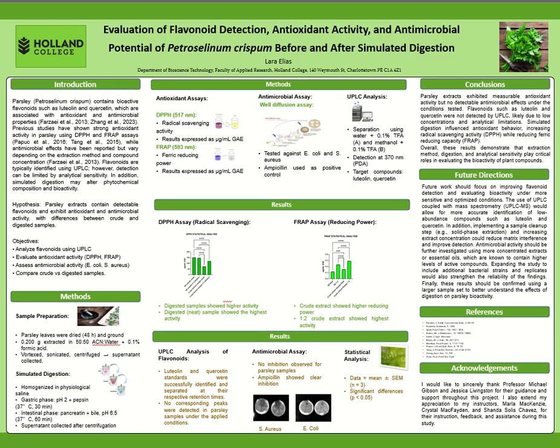Overall, these results highlight the importance of extraction, digestion, and analytical sensitivity when evaluating plant bioactivity. Future work should use more sensitive techniques such as UPLC-MS, include sample cleanup steps, and test more concentrated extracts to better evaluate antimicrobial activity.